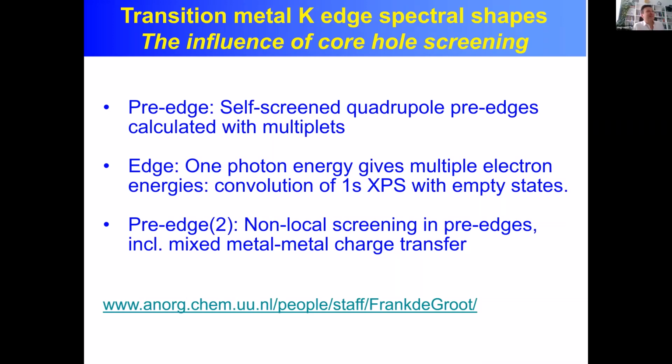Yeah, I think so. There are some things we don't really understand. It's not only the peak position, it's also the intensity. The intensity of HERFD is always larger than the intensity of normal X-ray absorption. And then you say, okay, that's because of the resolution. But if you broaden the HERFD again with the lifetime broadening, there's still too much intensity in the HERFD.